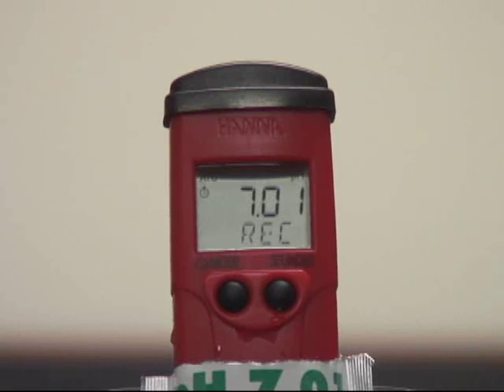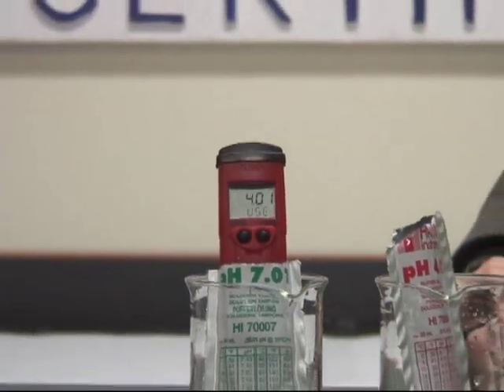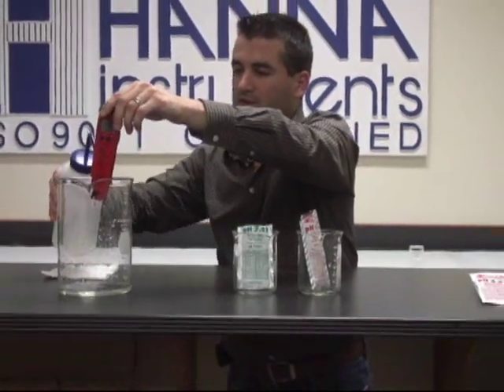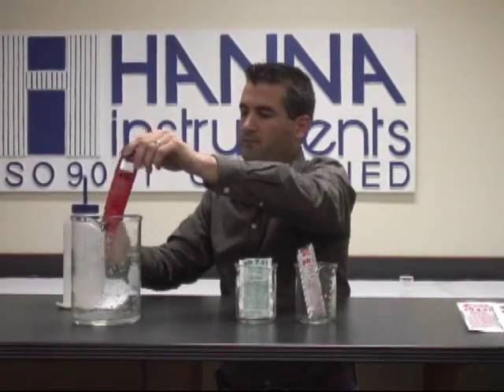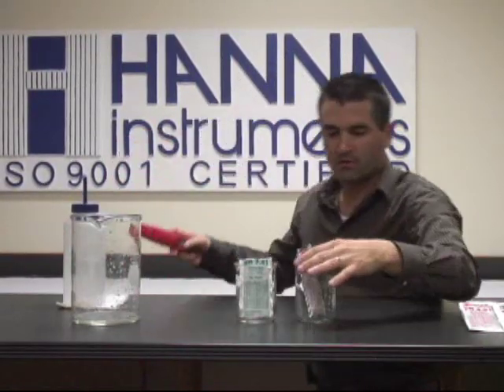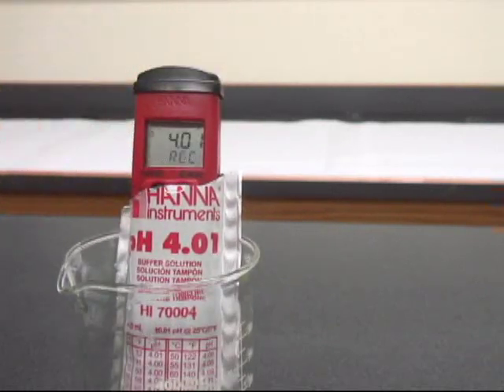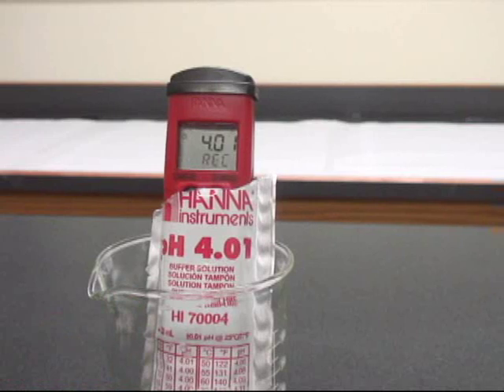Once the tester has accepted the calibration automatically, you'll see it request 4.01 buffer. We'll do a quick rinse in between, then put it in the 4.01 buffer and give it a few seconds to automatically accept that calibration.